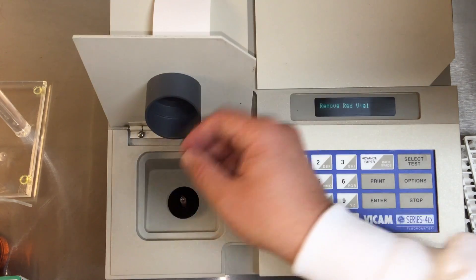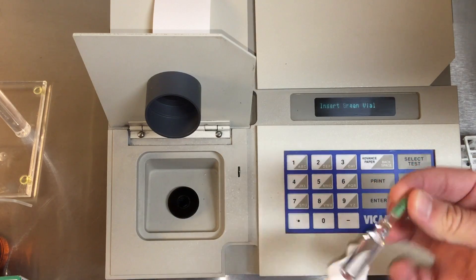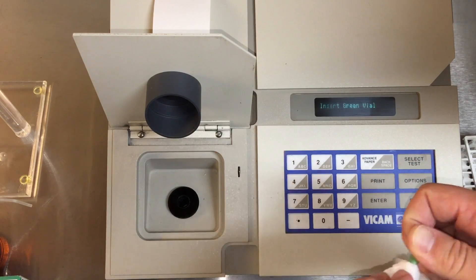When prompted, insert the green vial. Using the most recent procedures manual, insert the value for the green setting.